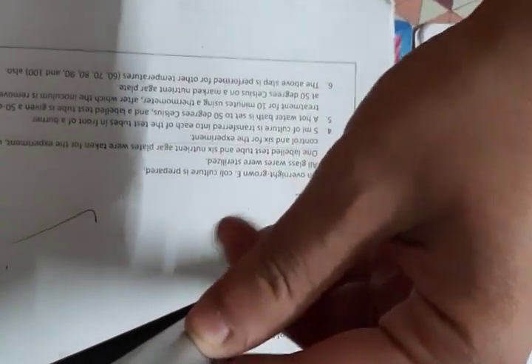And now the procedure. Yes, the procedure. At first we need an E. coli culture prepared overnight. And then what do we need?